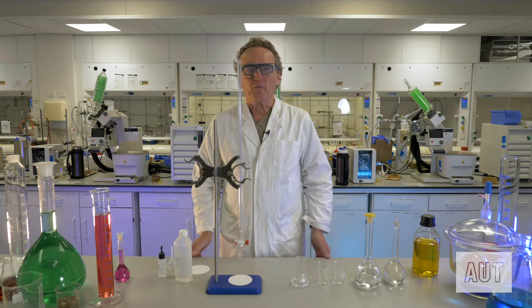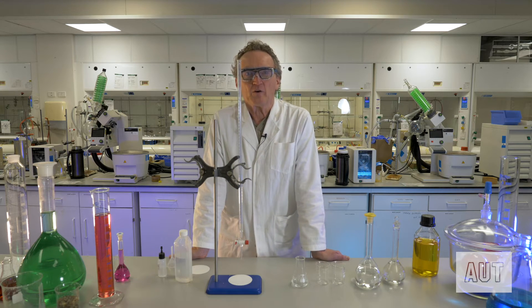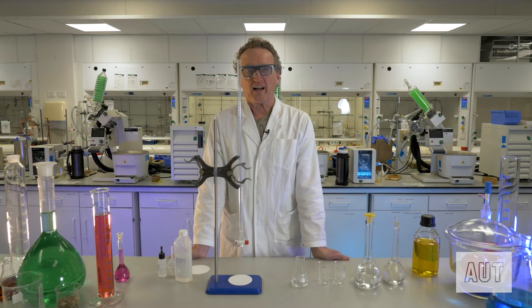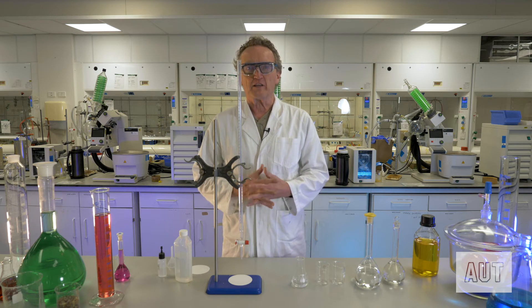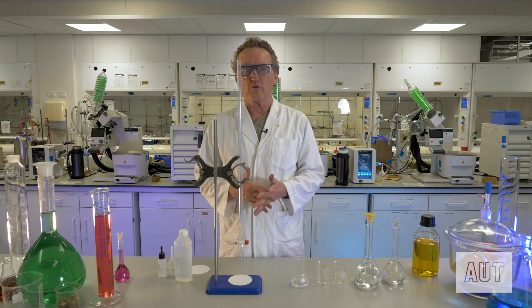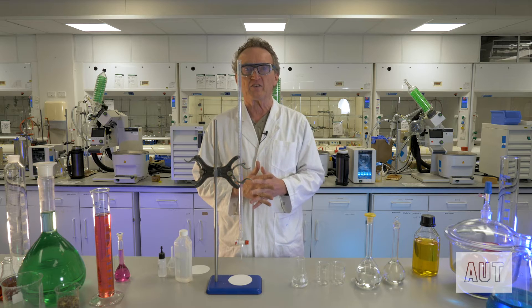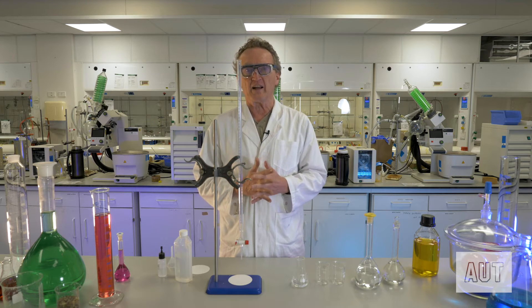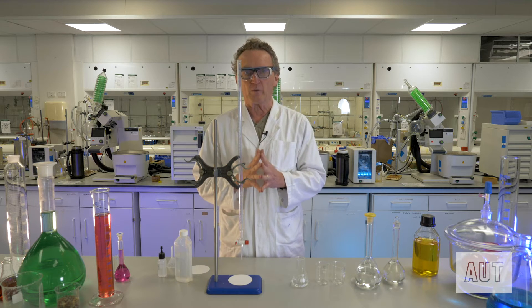Hi, I'm Prof L and welcome to Chemistry Matters. Today in the lab we're going to learn how to do a titration. Titrations are a very important part of chemistry — they're useful in determining the concentrations of unknown solutions by using known solutions to react with them. That's the fundamental basis of a titration, with a little bit of stoichiometry in there as well to figure out your unknown concentration.